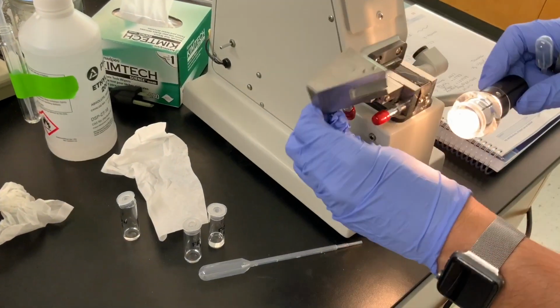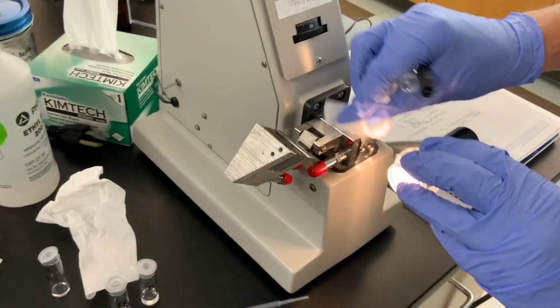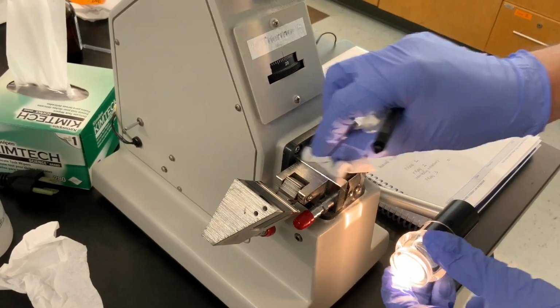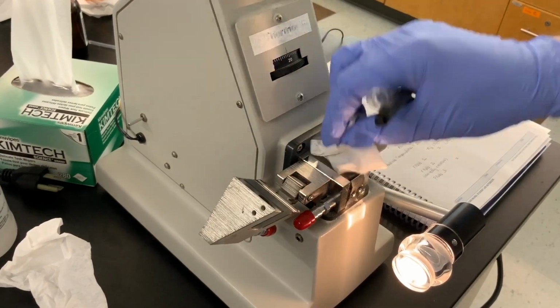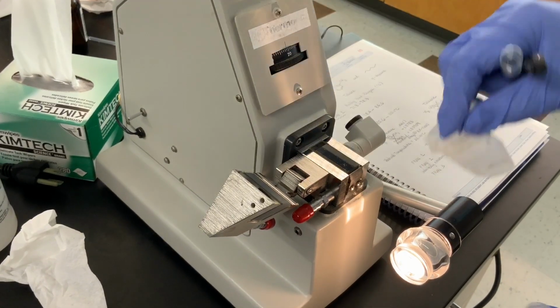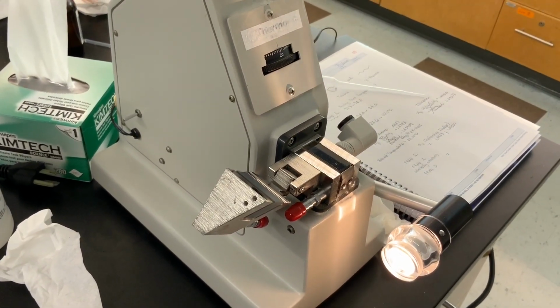But normally we don't take the refractive index of fraction 2, but since we've got a decent amount, we're just going to do that, and then we'll still be able to prove to ourselves that it's a mixture. But that makes complete sense because we knew that fraction number 2 was a wash.